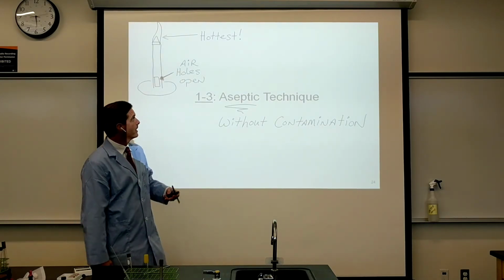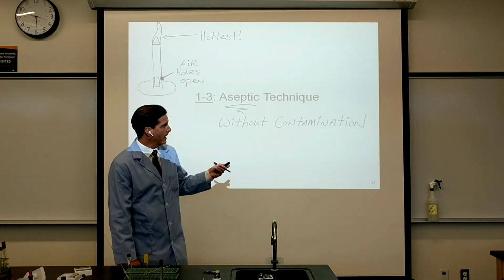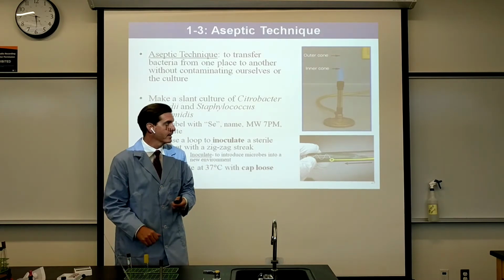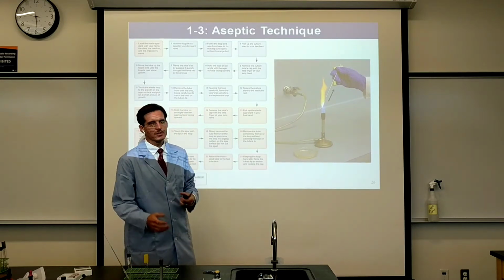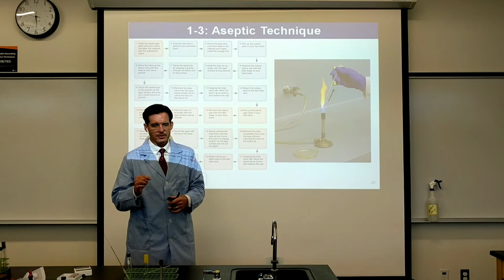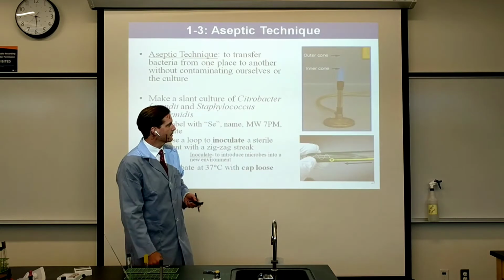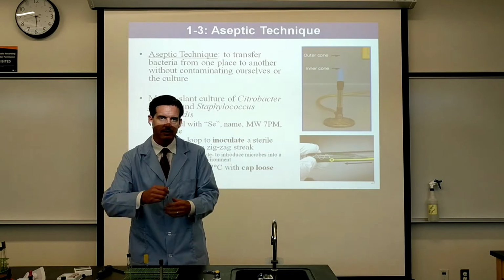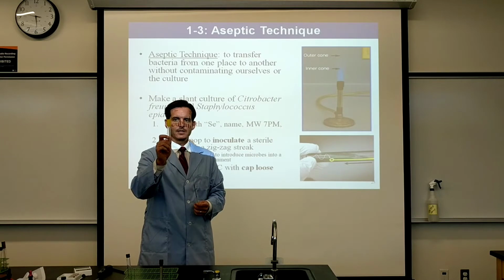I'm going to pretend temporarily to do this with the flame not lit, and then afterwards I'm going to go live with the transfer of bacteria from one test tube to the other. All right. So the first step that I'm going to do is flame the loop to sterilize it, so that it's prepared to pick up bacteria safely, and then I'm going to transfer from one tube to another. Let's see. I'll go ahead and try this out. So let's pretend that the first tube I'm going to be working from is this one with the yellow cap. We'll call this tube A.